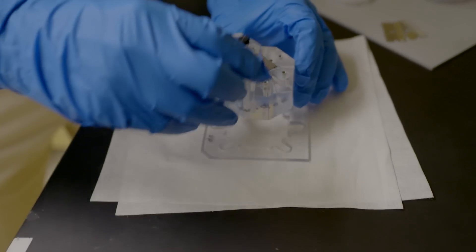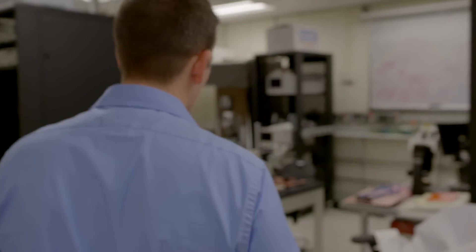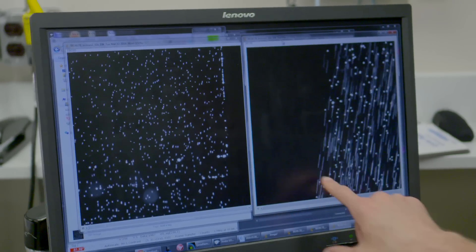We do some glass bonding processes where the glass has ports in the surface. Those chips are then mounted within some fluidic jigs. After we have the chips mounted in the jig, we take that over to our fluorescence microscope, where we can start to pump fluids onto the chip at a set velocity. The particles we're separating are roughly one ten-thousandth of a human hair — this is the size scale of the nano scale range.